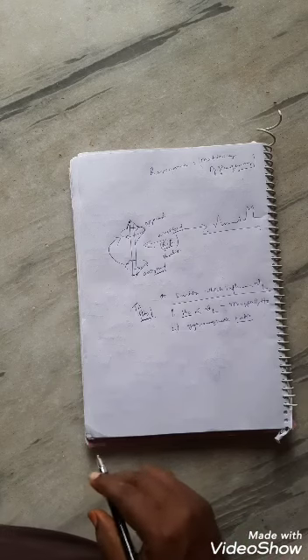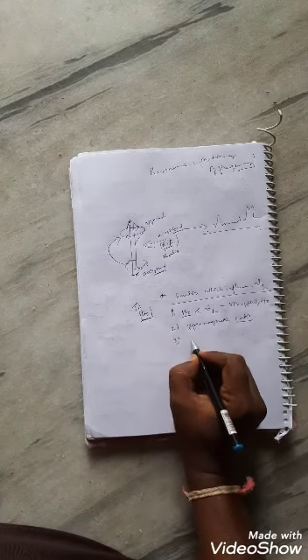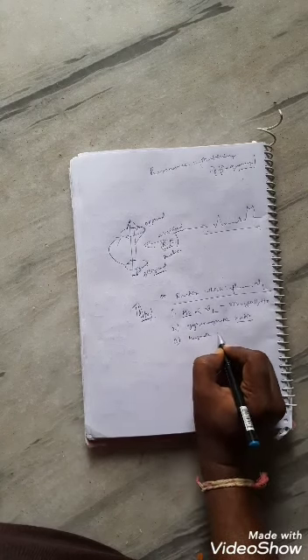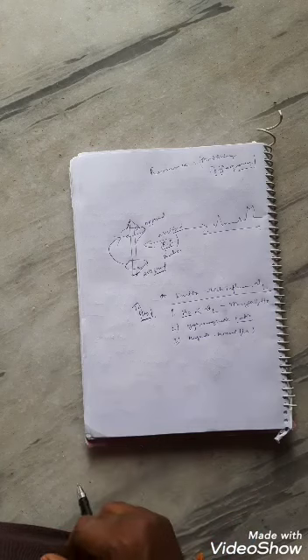In the case of proton NMR, it is the gyromagnetic ratio of a proton, that is around 26,753 radians per gauss per second, right. And the third one, the magnetic moment of the nucleus, whether that nucleus is magnetically active or inactive. If it has more magnetic moment, it will have higher precessional frequency.